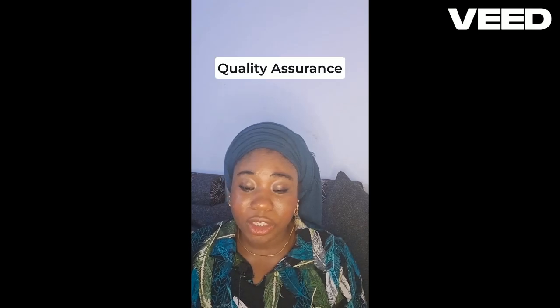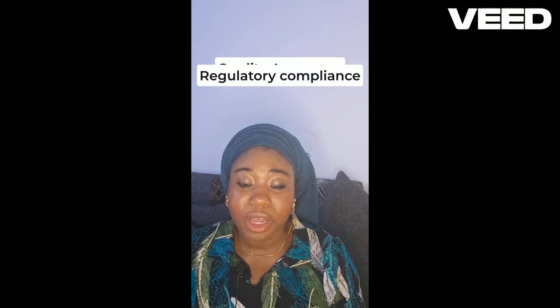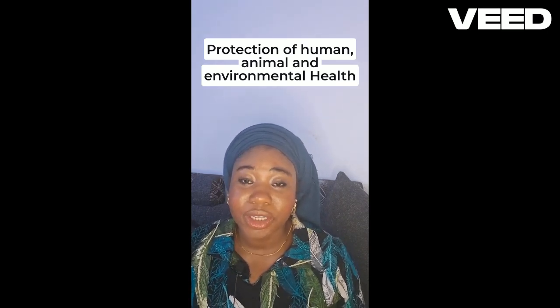Importance of good laboratory practices. What is the importance of good laboratory practices? Quality assurance is number one. It is essential for quality assurance. It is also important for regulatory compliance and protection of human, animal, and environmental health. Also, data integrity and transparency are ensured with good laboratory practices.